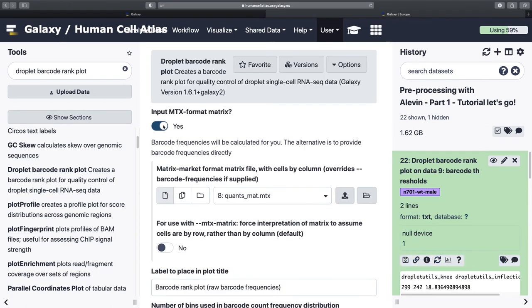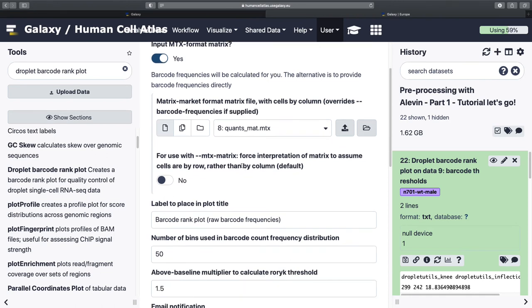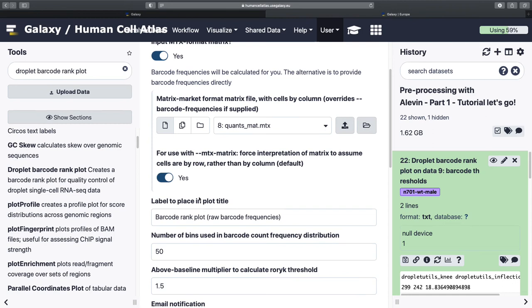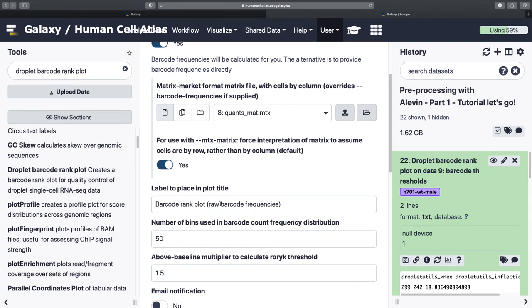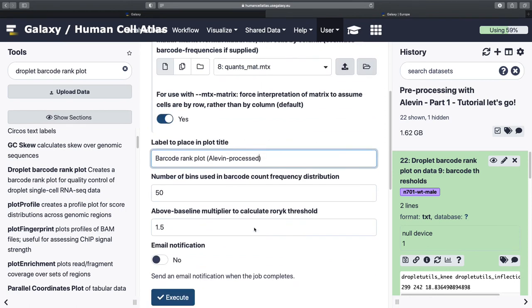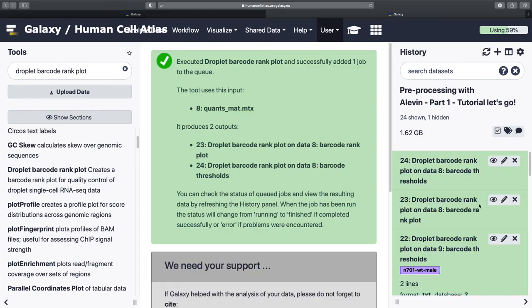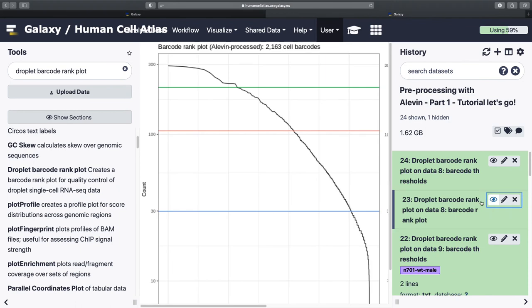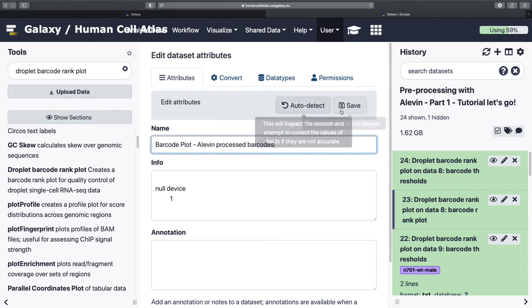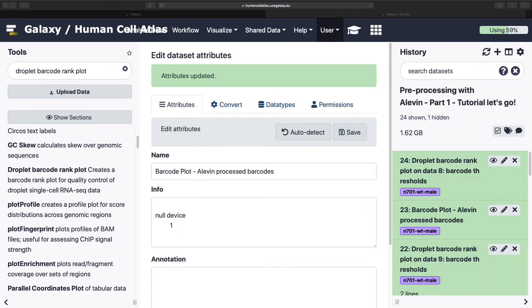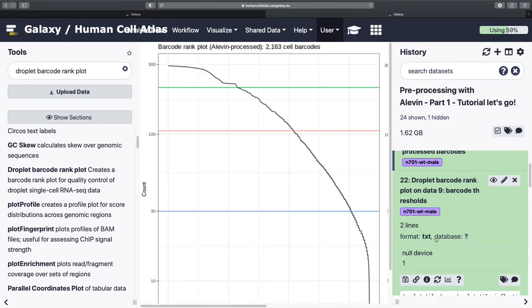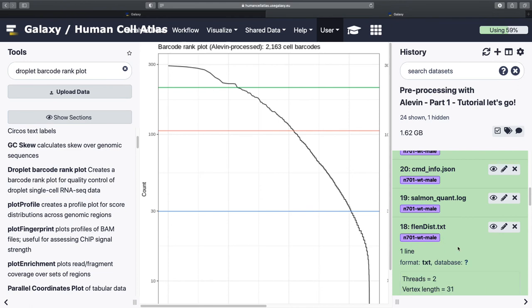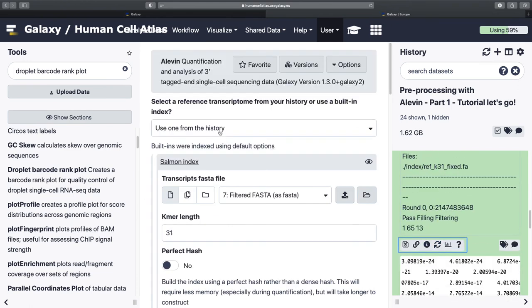But this time we are going to input in matrix market format. Quants mate dot matrix. Because we're looking at Alevin processing. And we can look at what Alevin did. Rename. And onwards and upwards. We're going to run Alevin again. I'm going to cheat and rather than look for the tool, I'm just going to rerun it.